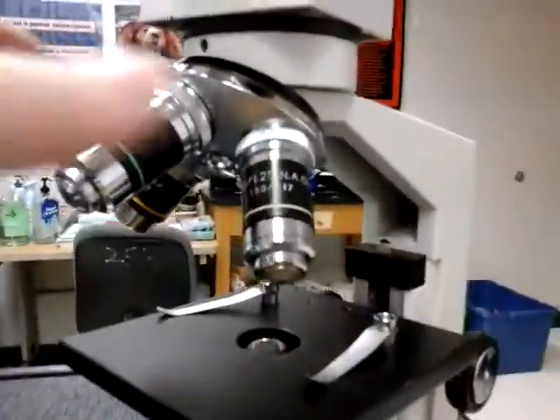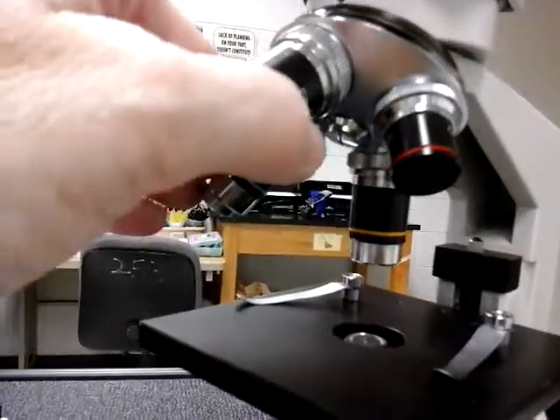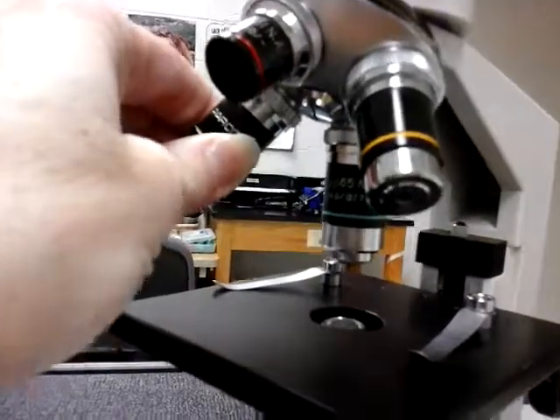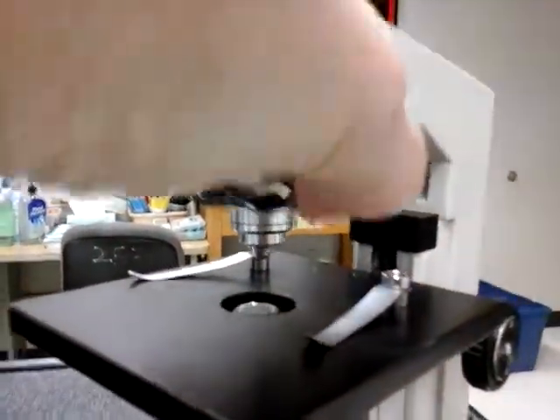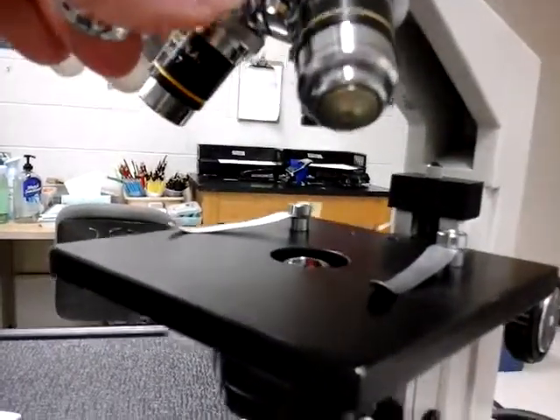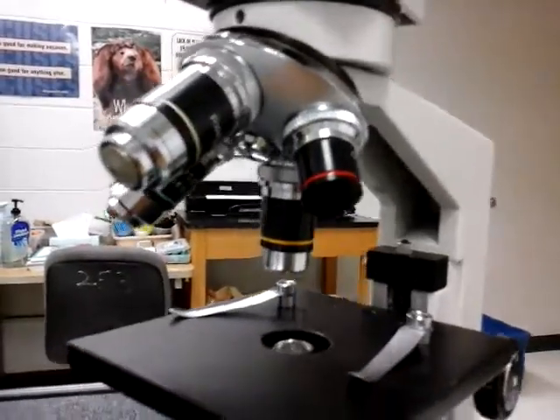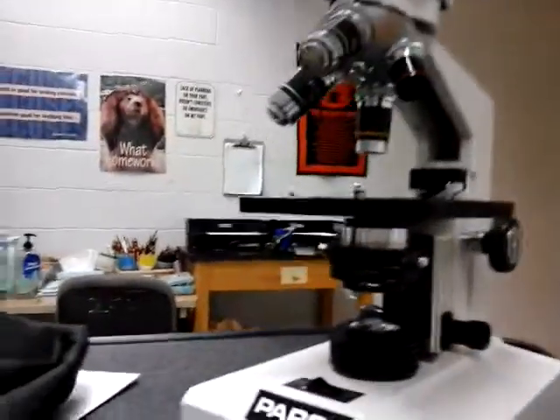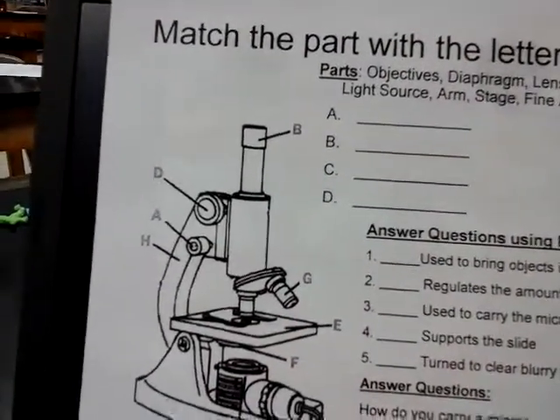Now, our microscopes have 4 objectives, and they're color-coded, and they're different lengths. So you can see red, yellow, blue, and white. Okay. Red is the objective you always start on. Okay. Red is short, so it magnifies things the least. So on your page, write red. Okay, so somewhere on your page, just put like red objective, put red equals 4x.